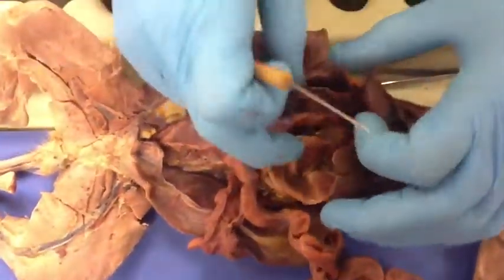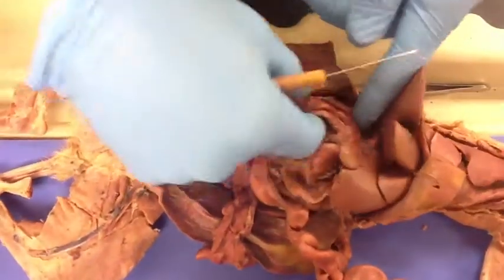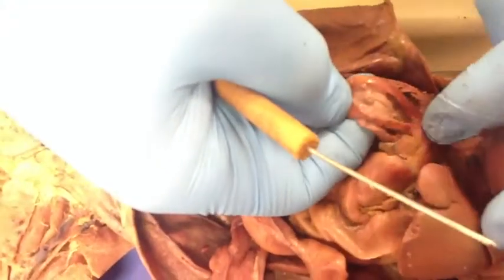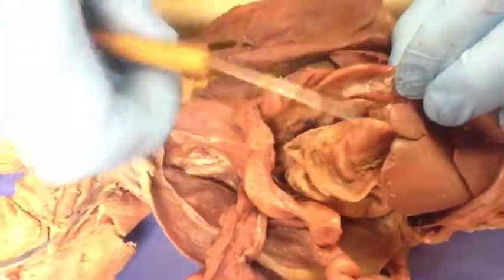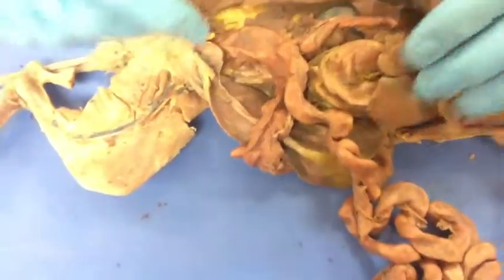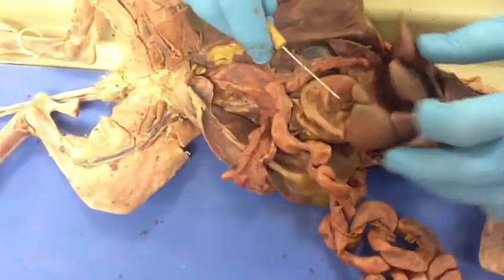And it goes into the duodenum right here, which is the first part of the small intestine where the bulk of the digestion takes place. And cut it open here, and you can see the small folds in there, the plicae, which, with the villi and the microvilli, all help to increase the surface area of the small intestine and aid digestion because there's more area for absorption and digestion. And then here we have the lobes of the liver.